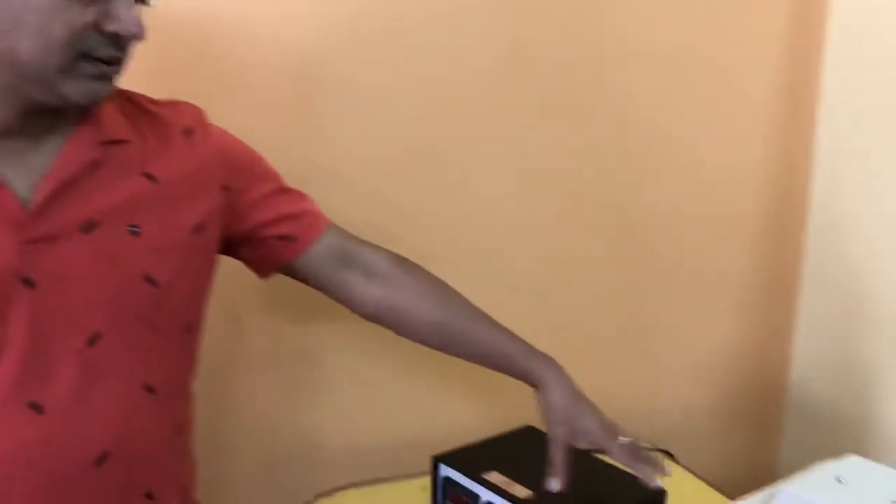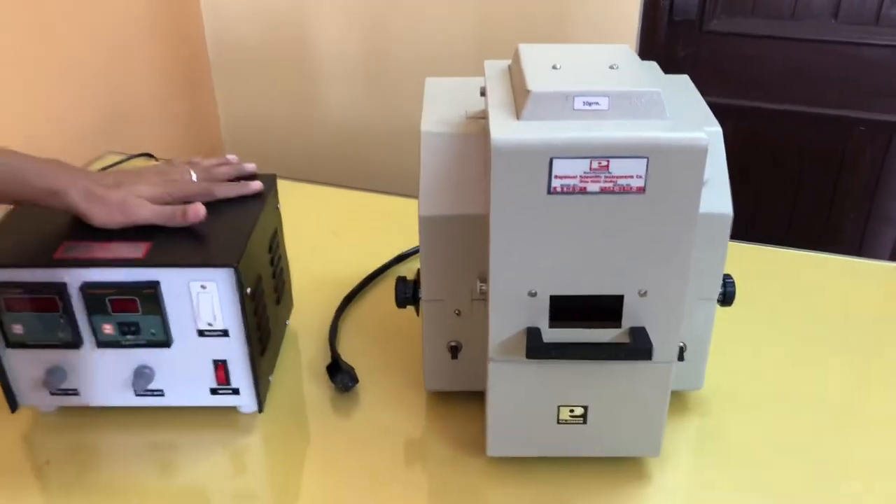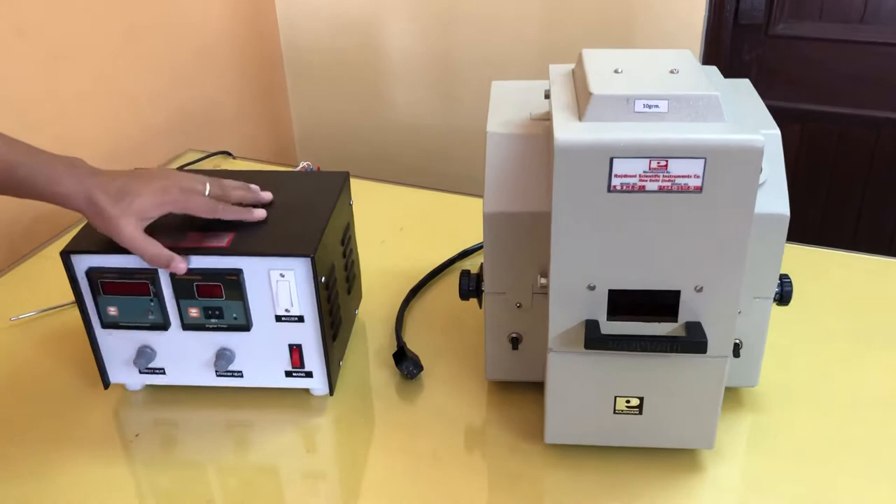Hi, I am Sudhir Tyagi from Rajdhani Scientific Instruments Company. Today I am going to explain the working of the Infrared Moisture Balance Model RSMA2A. RS stands for Rajdhani Scientific, MA stands for Moisture Analyzer, and 2A is the model number.